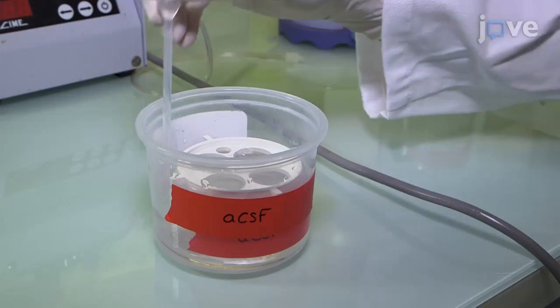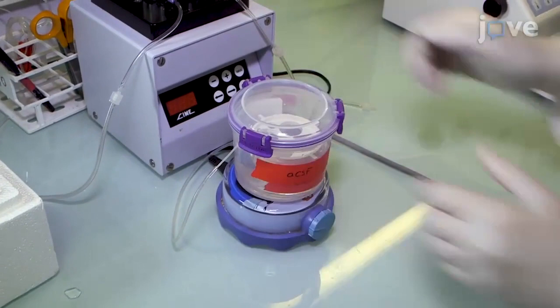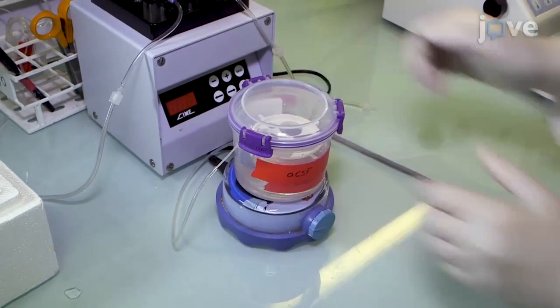Add a few millimeters of ACSF at the bottom of the food box, and start bubbling the fluid with carbogen. Then close the sealed box while maintaining constant carbogenation to create a humidified, 95% oxygen, 5% carbon dioxide rich interface chamber.